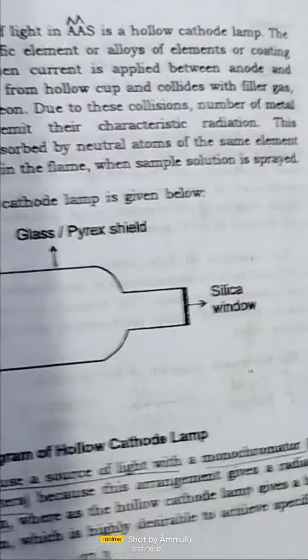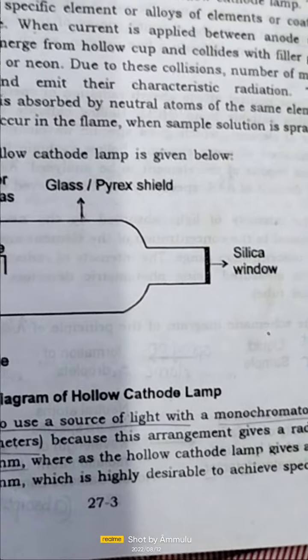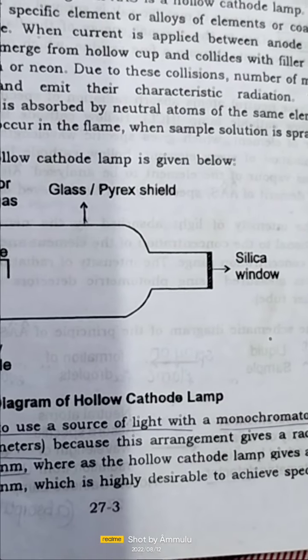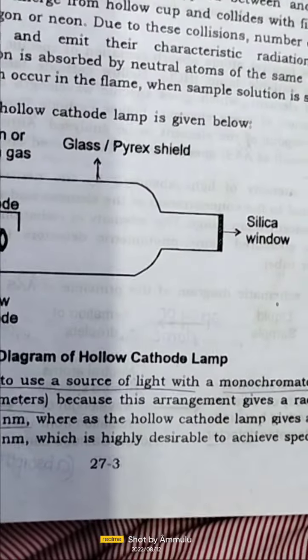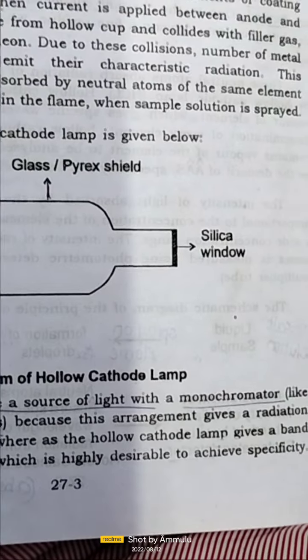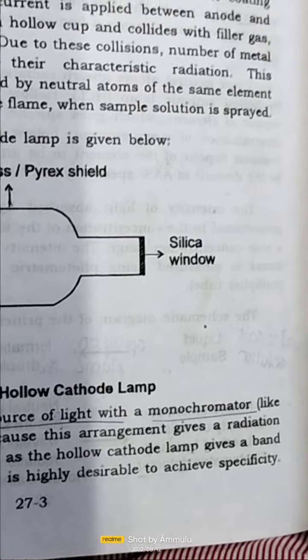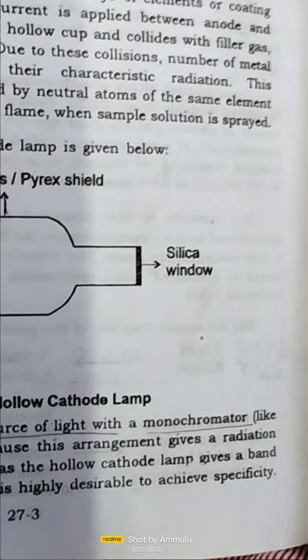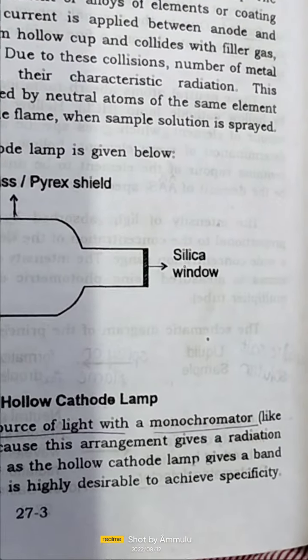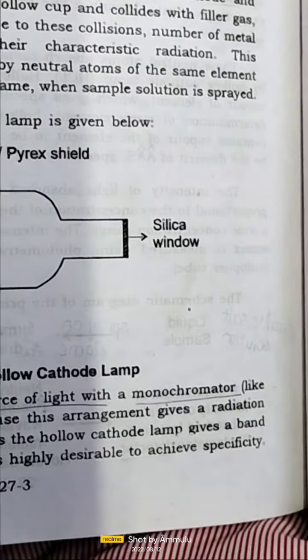In atomic absorption spectroscopy, the temperature of the flame is not critical, since the thermal energy of the flame is used just to atomize the sample solution into fine droplets and neutral atoms. The number of elements which can be determined by atomic absorption spectroscopy is far greater when compared to those which can be analyzed by flame photometry.